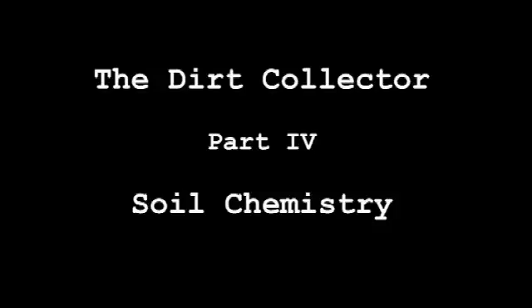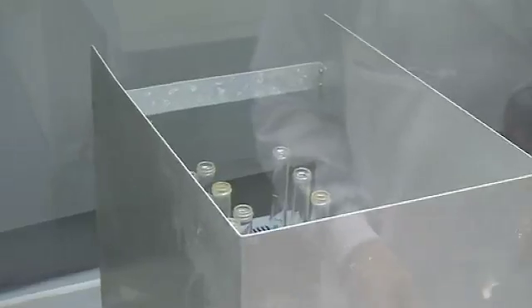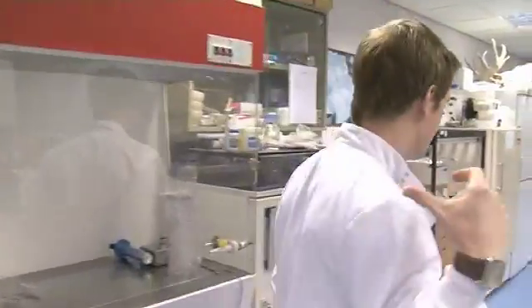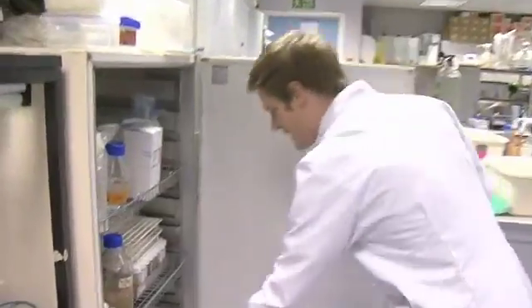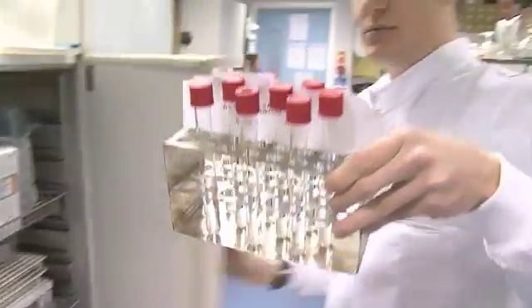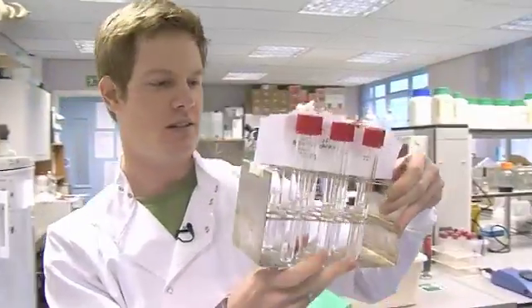First I need to get rid of everything I don't need from the plants, which includes all the organic matter — all the greens and browns, all the pigments. To do that I need to use a very strong acid: sulfuric acid. The next step, once I've taken what's called the digest, I get this, which has had some deionized water added.